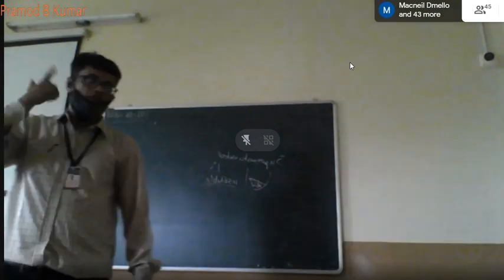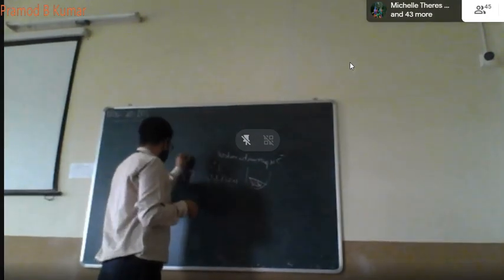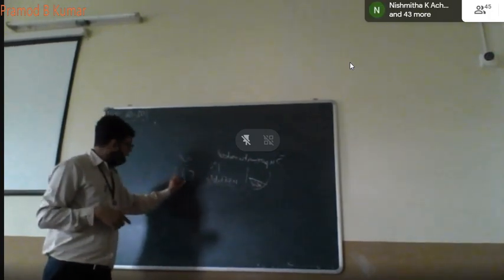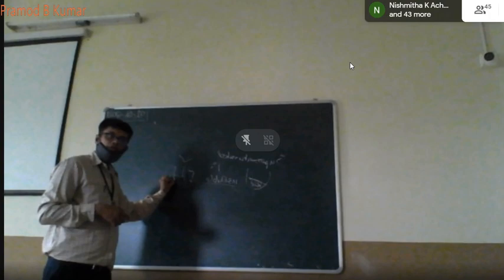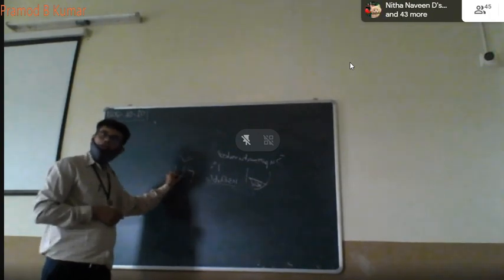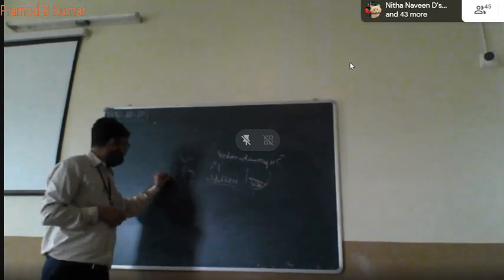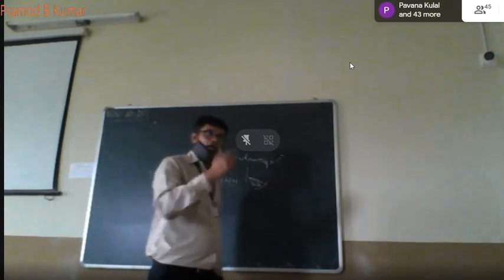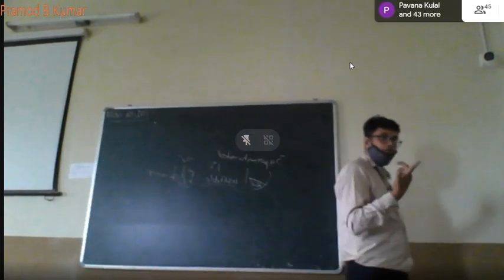The insoluble impurities will be in the funnel and you get a clear solution, which contains the compound as well as the soluble impurities.